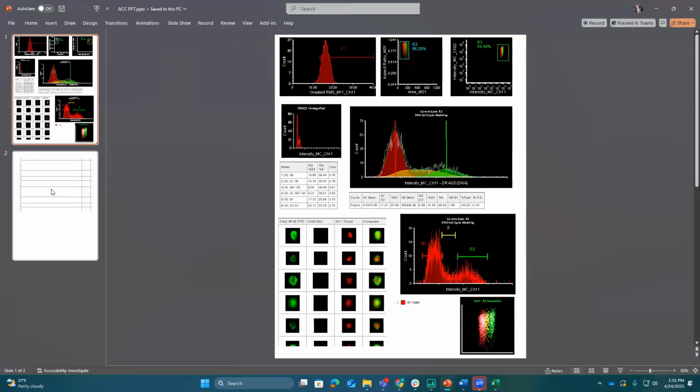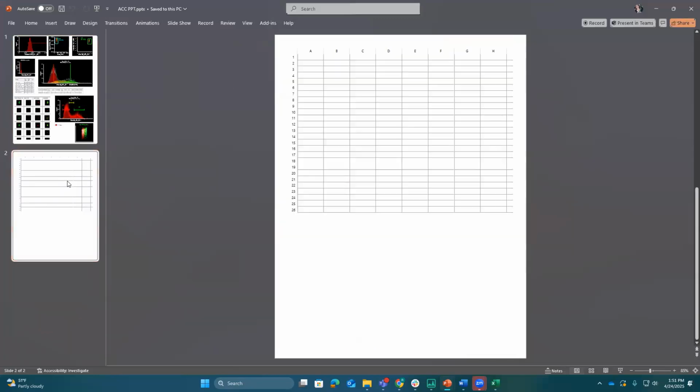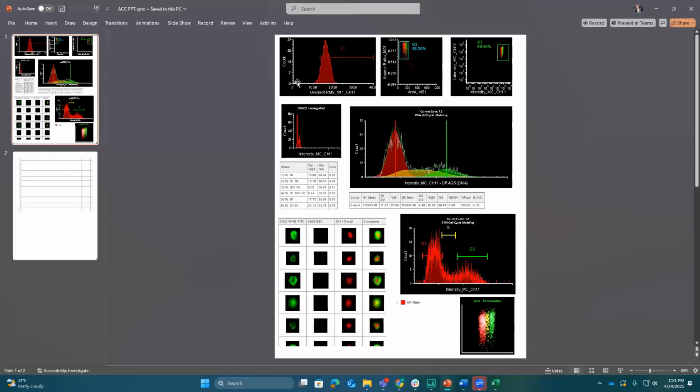Here is my PowerPoint. I forgot to tell it to just do that one page because I added the spreadsheet. But I would have a nice report here. If I had multiple pages and did just one page, I would have all this information reported and compiled out into a nice presentation here.